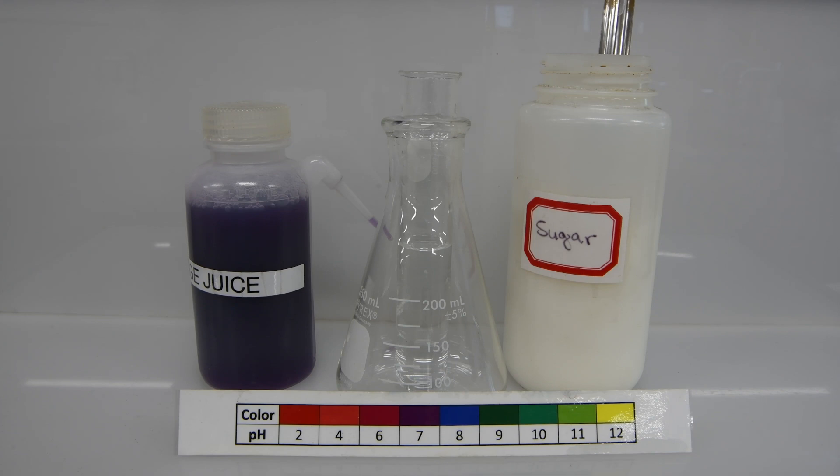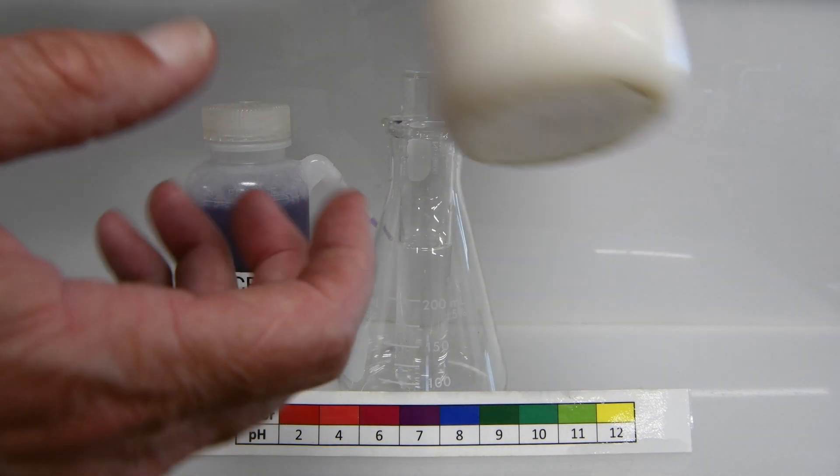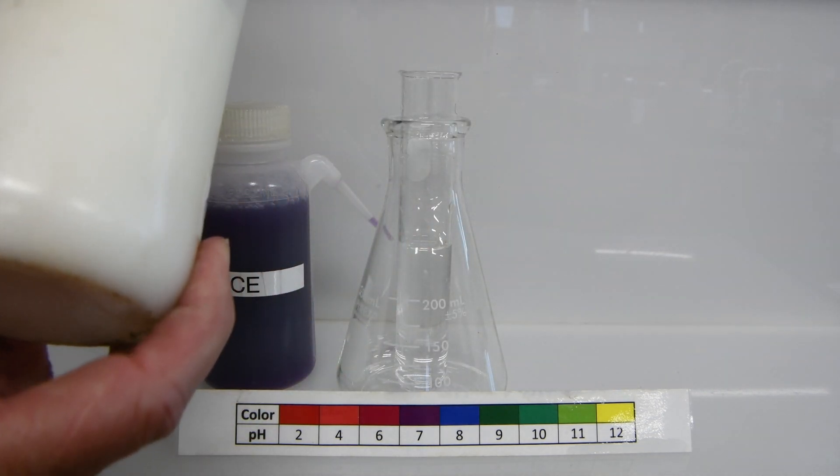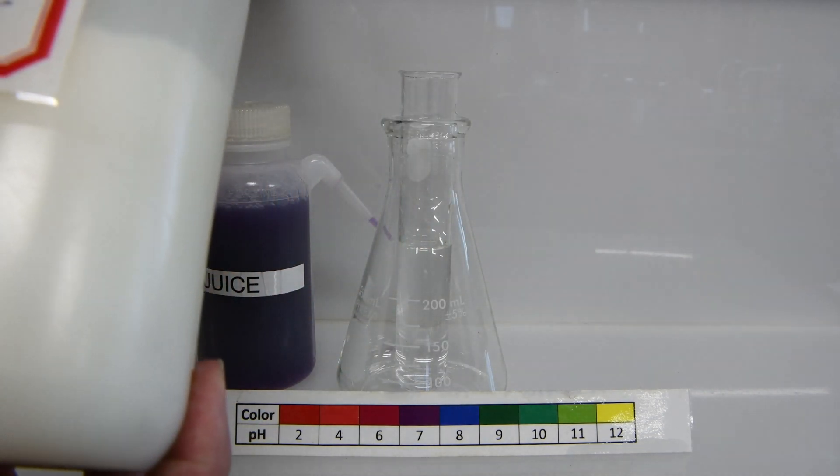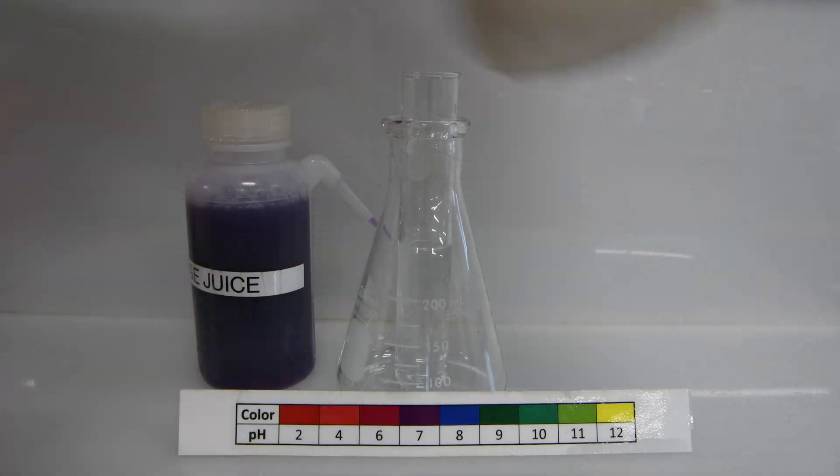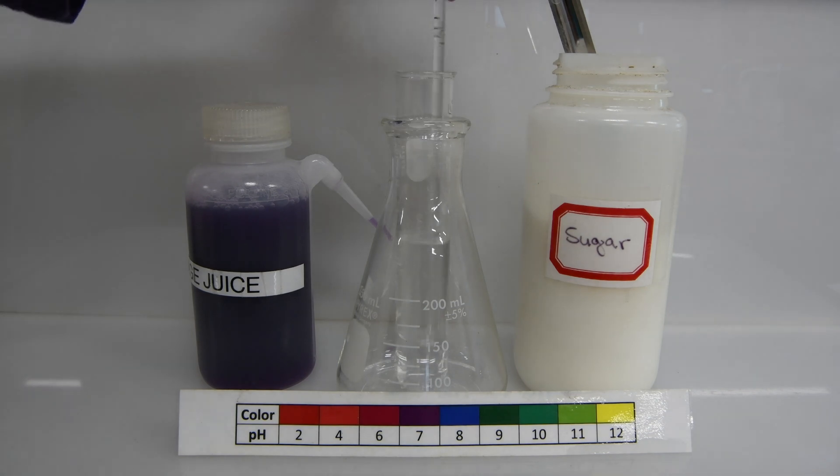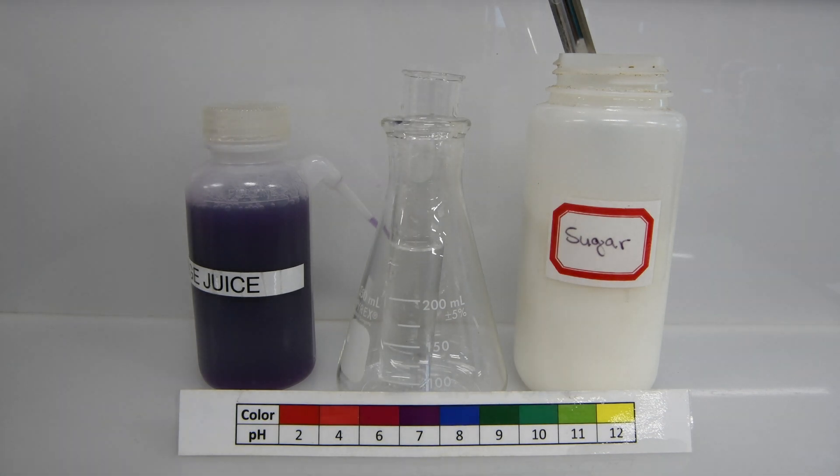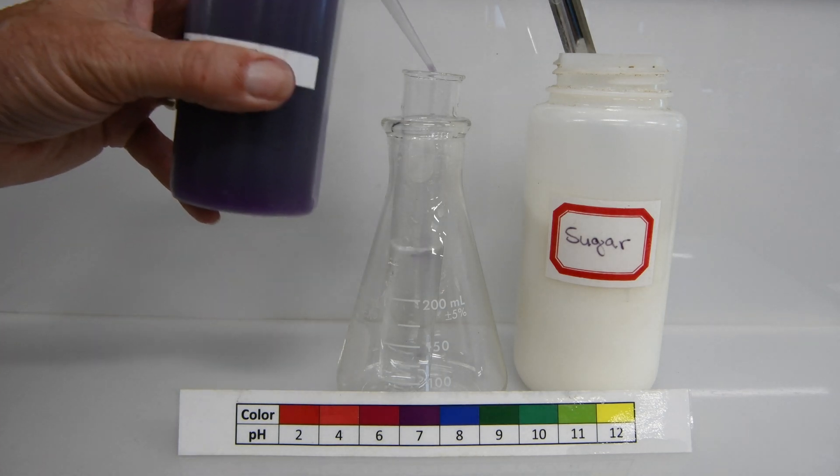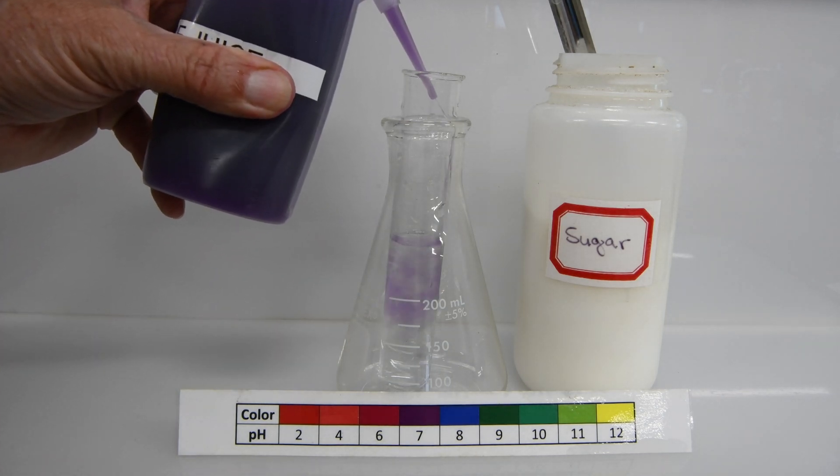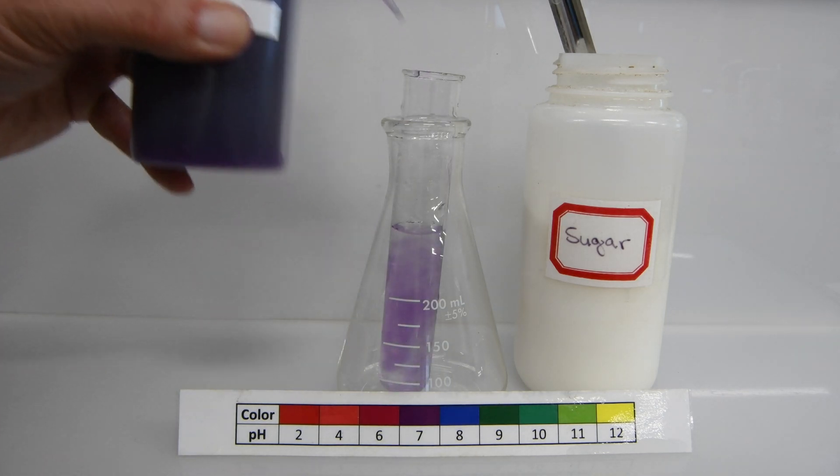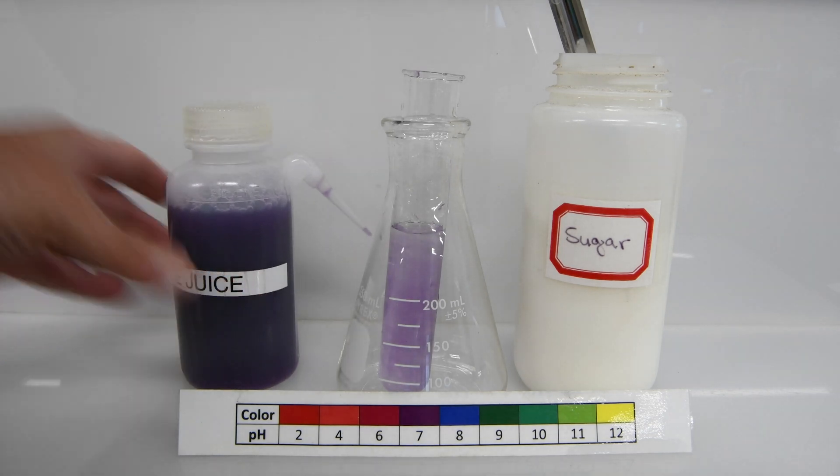Next, we'll be testing a sample of sugar. I've already added some deionized water to the test tube. So let's go ahead and add a small amount of sugar. We'll then need to stir it to make sure the sugar is dissolved in the water. And then we can go ahead and add our cabbage juice. And it appears that the color has stayed the same.